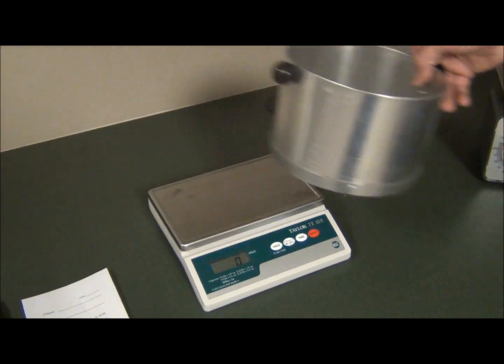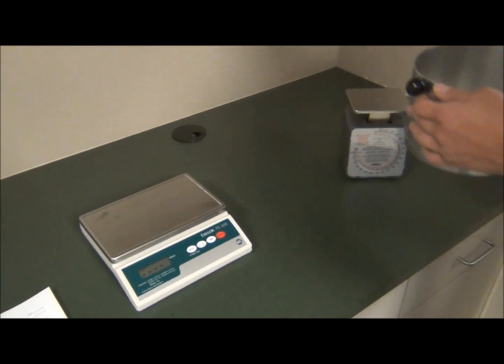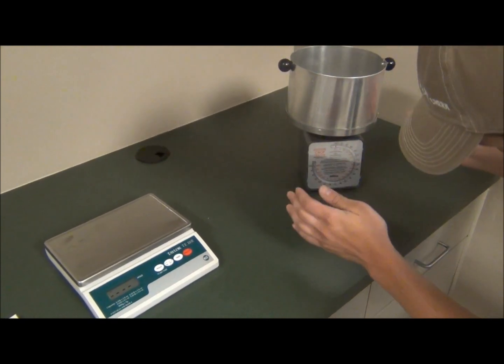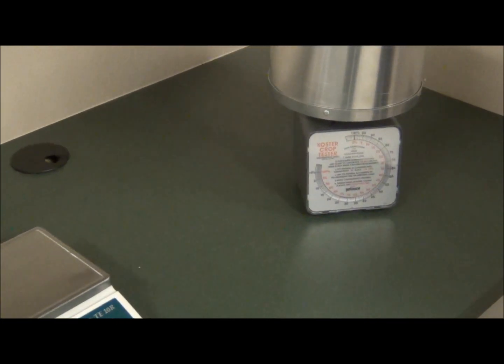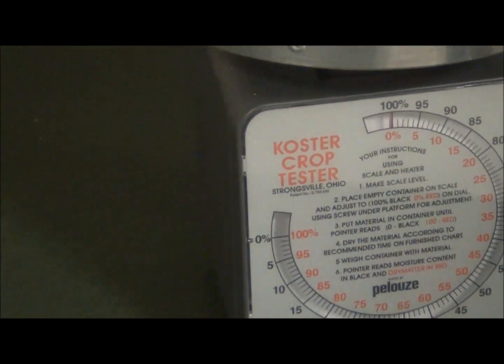The first step in the multi-step process of drying feed is to tare out the weight of the specimen container. This is done by placing the basket on the scale and zeroing out the scale. If using a mechanical scale, as we will be using in this demonstration, the red number should read 0% and the black number should read 100%.